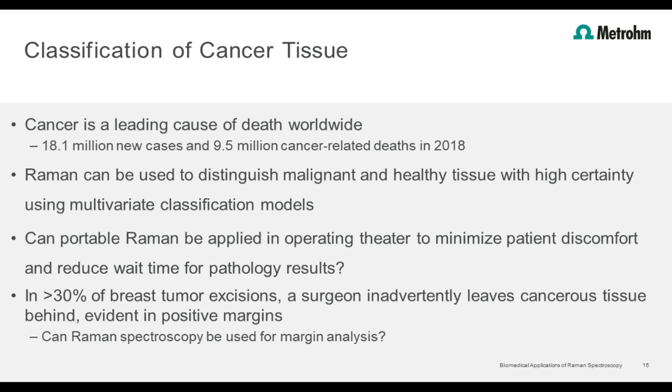And so there's really a big push for portable Raman to be used in this space. Because like I was saying, that means that your measurements don't have to be done in a lab. They can be made, for example, in an operating room. And so having the portable Raman system can provide real-time guidance for a surgeon.